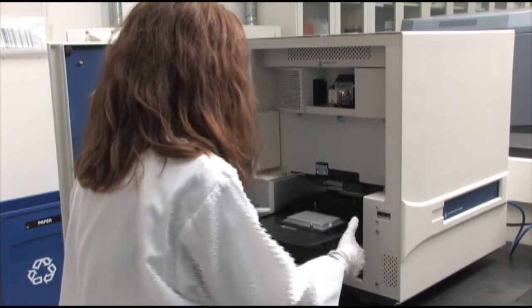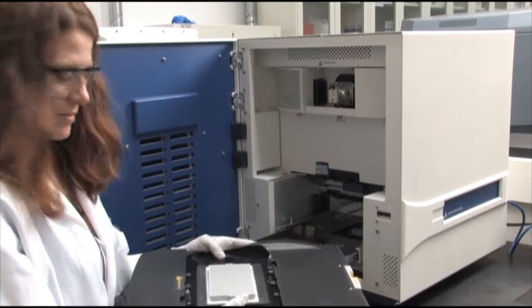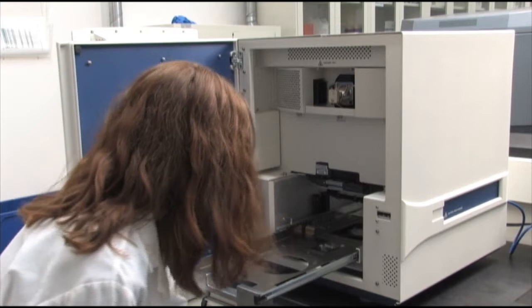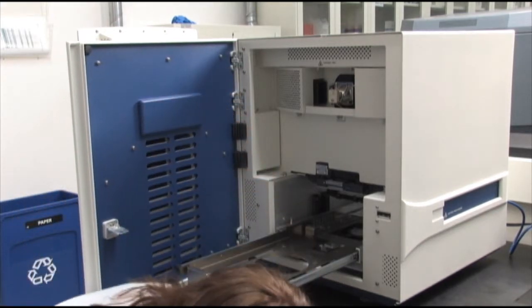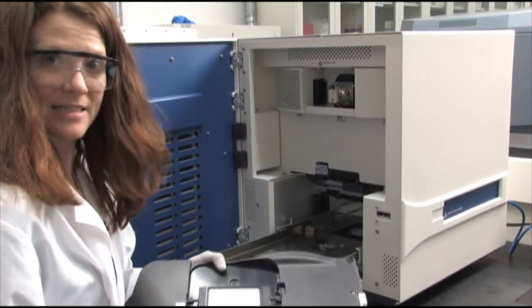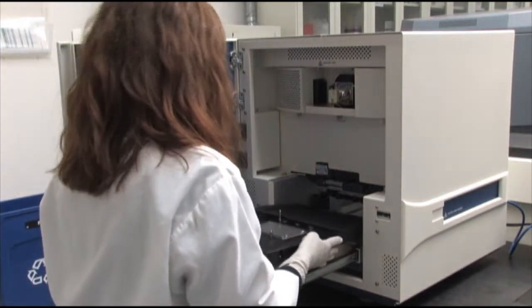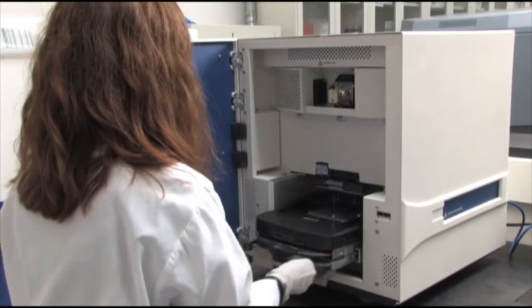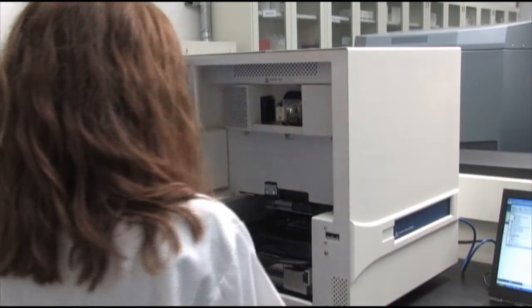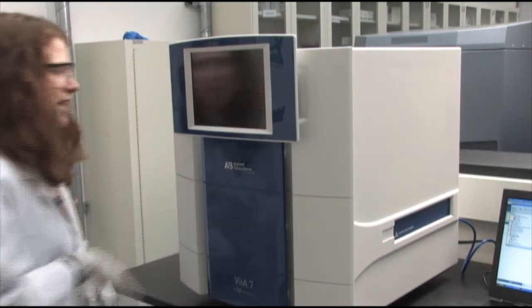I'm going to open up this drawer. As you can see, this is the 384-well block. I'll set this in here, close this drawer, and then I will take out the TaqMan Array block. If you look at this block, you see that it's flat. I'm just going to set that here into this tray and close it. The block's in — close the instrument and turn it on in the back.